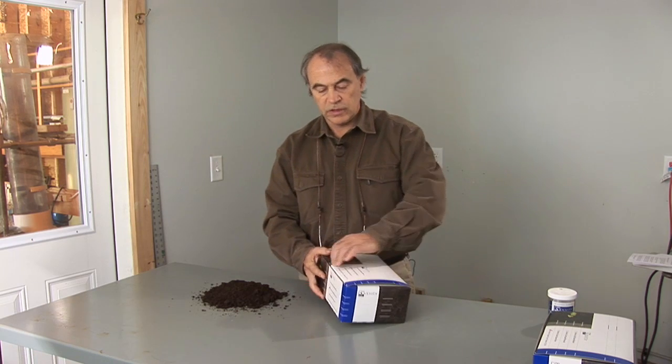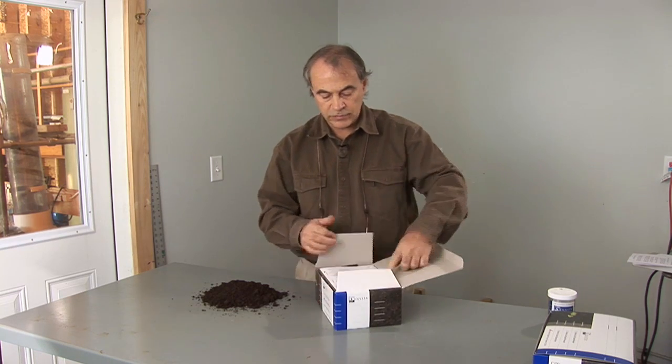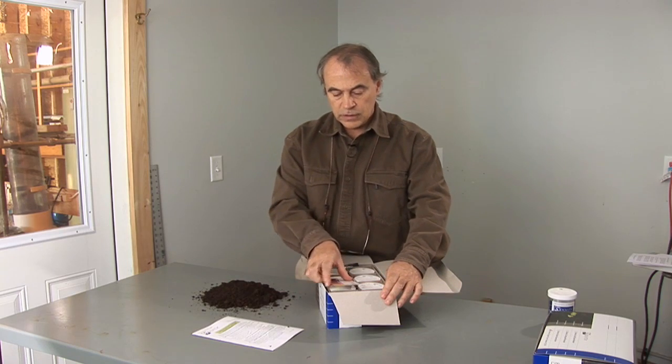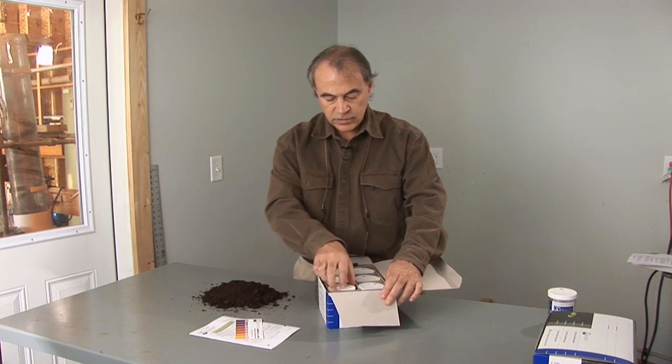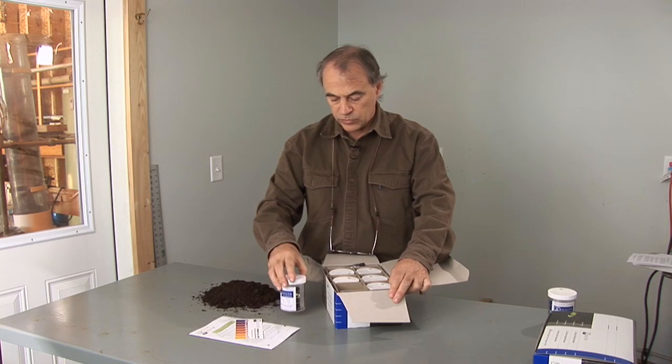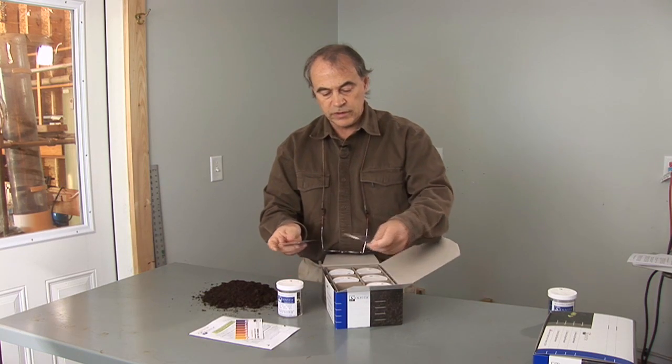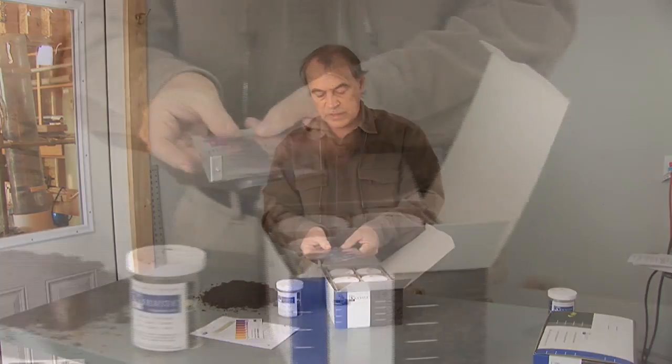You have your compost test kit, and you're going to open it and take out the various parts, which include the manual, the color chart for the test, the test jar itself, which we're going to fill with sample, and the paddles, which are the indicators for the test.